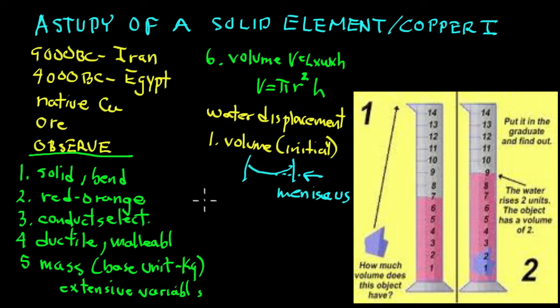We get the initial volume. And then we put the object in. Insert object.